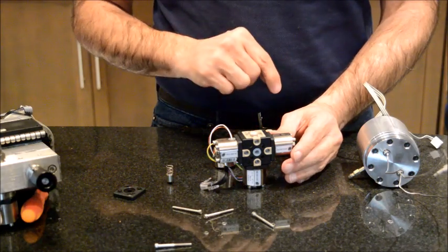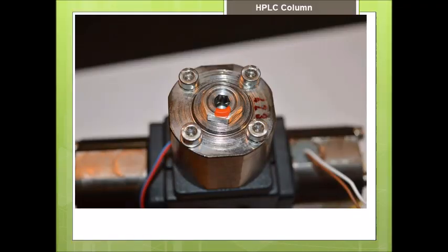We are looking at the solenoid valve from the top. As I said before, the screw in the middle has something to do with calibrating the solenoid valve itself and we shouldn't be opening that. In order to dismantle this unit, we need to unscrew the four screws on the corner.